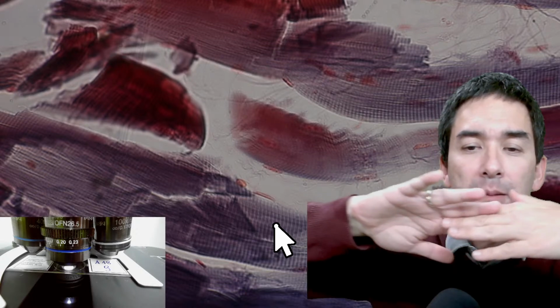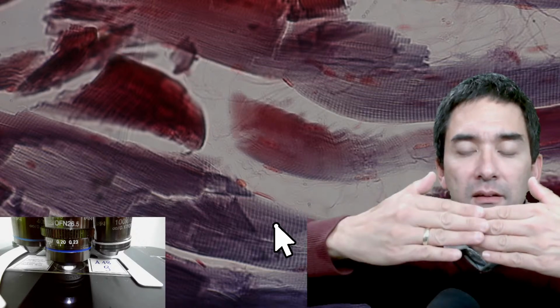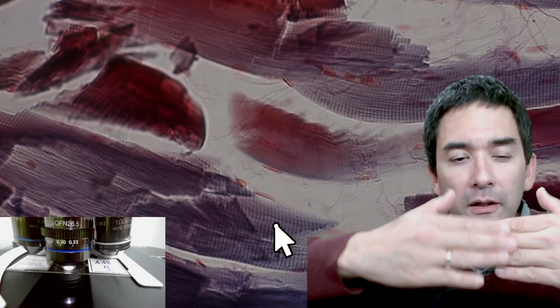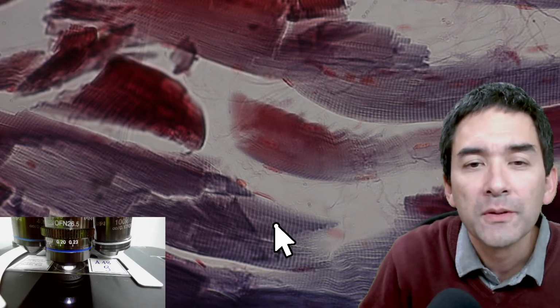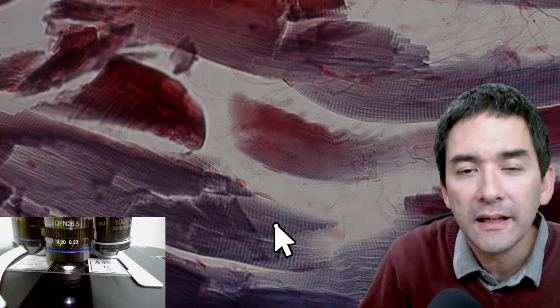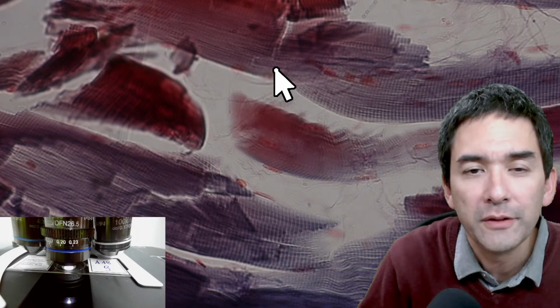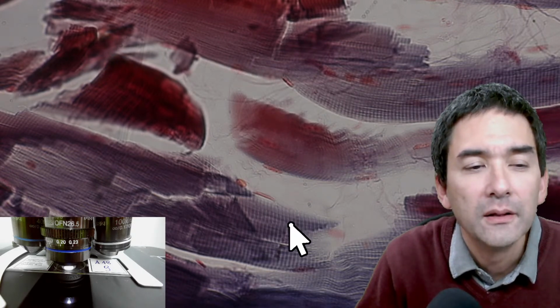Okay? And it's the type of protein fiber, there are two different types, that gives you the light and the dark bands. And these are basically the striations. So the protein fibers run lengthwise like this, here's the arrow, and then the muscle is able to contract this way.